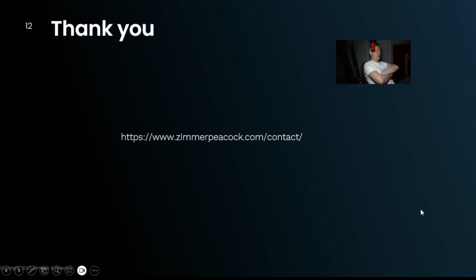So I want to say thank you very much. As I say, the intention of this week's webinar was just to demonstrate how to upload amperometric data from a GalvanoPlot potentiostat into Djuli. If you have any questions, don't hesitate to reach out to us. Okay, thanks very much.